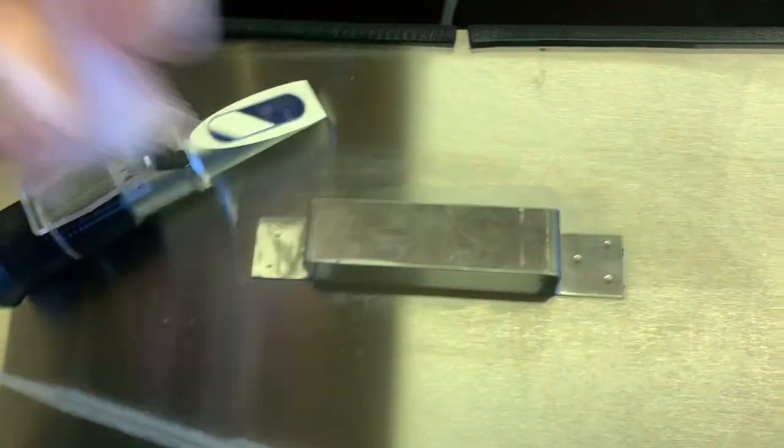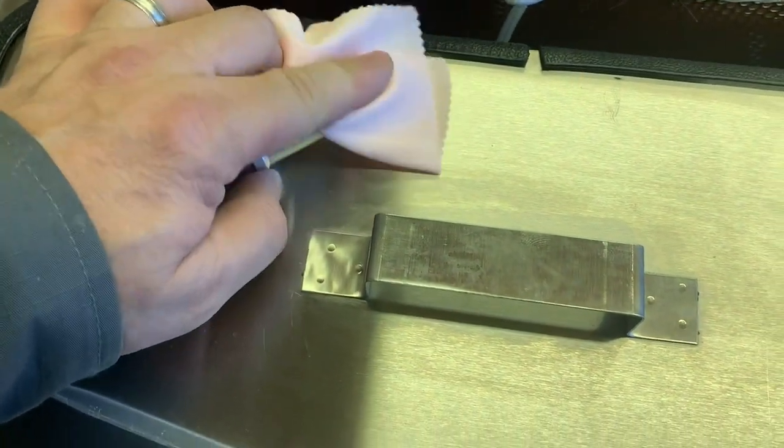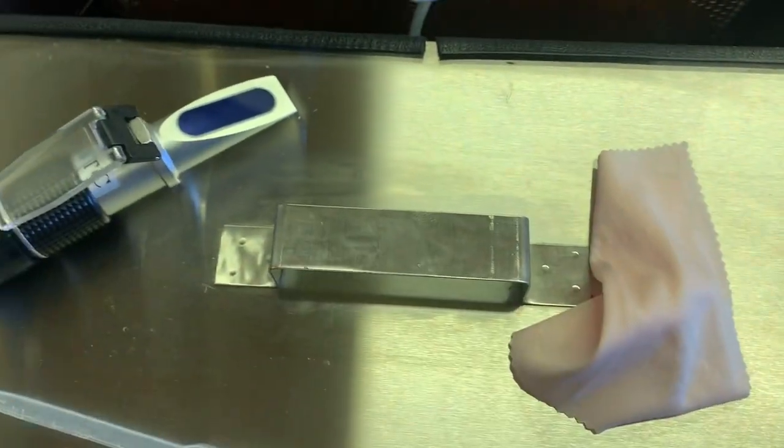The refractometer also comes with a little cloth, so you want to make sure that you clean that lens really good so there's no moisture on it to contaminate your sample.